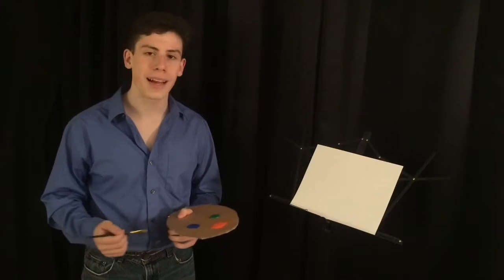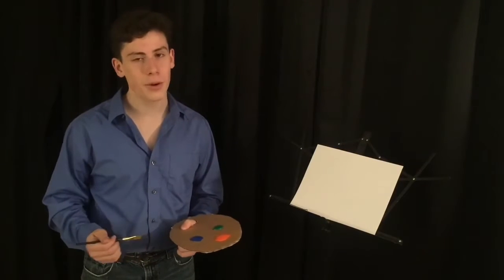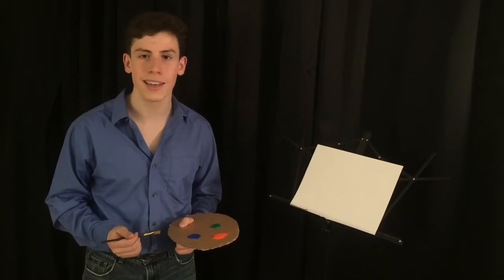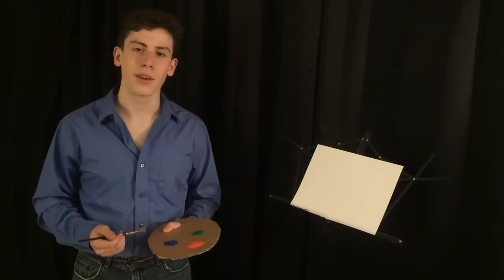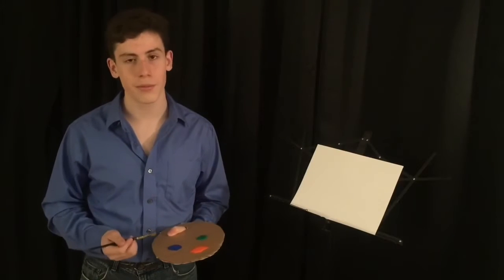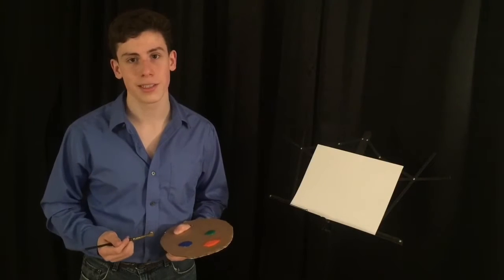Hey y'all, and welcome back to the Joy of Solutions. I'm your host, Rob Boss, and today we're going to be mixing a doozy up. Today, my friends, we're going to be reducing the concentration of some acids, but for those of you who haven't been around here before, we're going to need to talk about how to describe those concentrations.